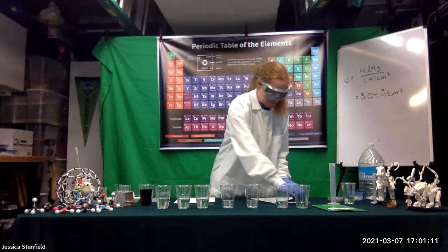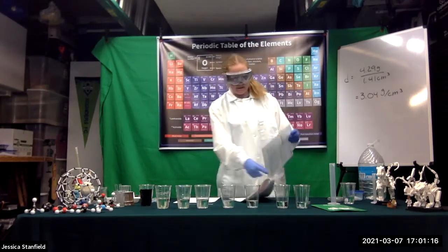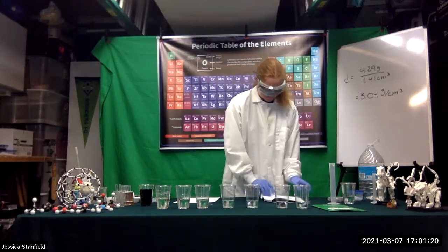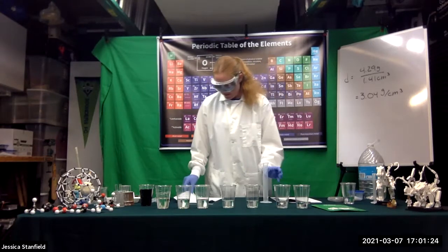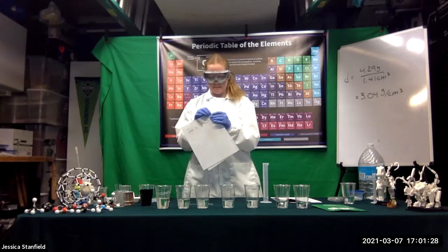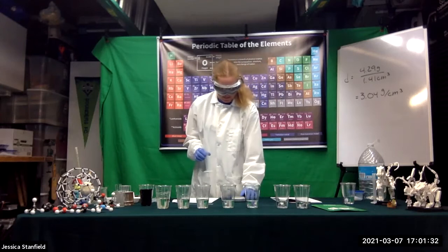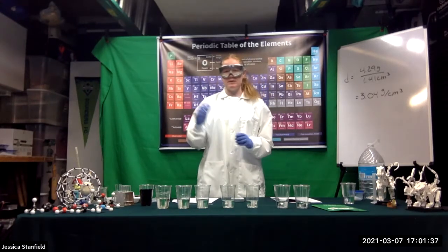I'm not going to do the other two. Let's go ahead and move on and talk about the density of our sucrose solutions. What we want to do is get our data table up for our solutions. The first thing we need to do is weigh our graduated cylinder. Instead of taring, we're just going to be doing a subtraction.